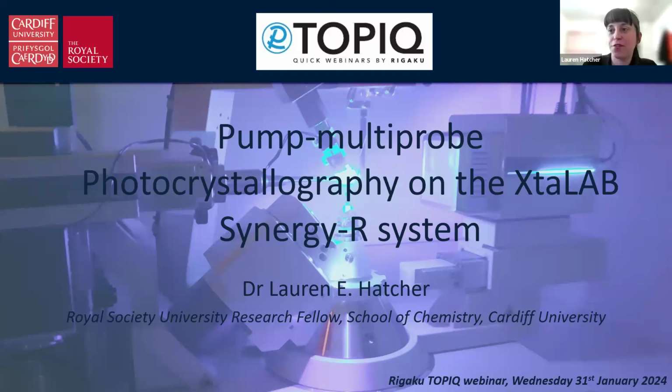Thank you very much, Josh, for that very nice introduction. It's nice to see Josh moving into his new role as well, which is very exciting. For those of you who don't know me, as Josh just said, my name's Lauren, and I'm a Royal Society funded university research fellow at Cardiff University. As Josh has said, I'm going to tell you a little bit about our developments of time-resolved crystallography studies using our new XtaLAB Synergy-R system at Cardiff. Let me make this hop along. Is it going to do it?